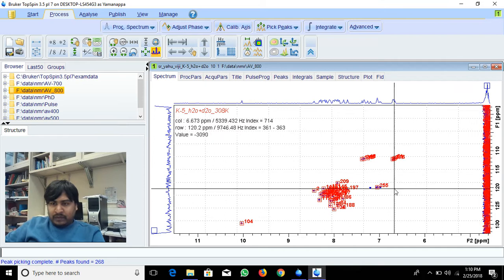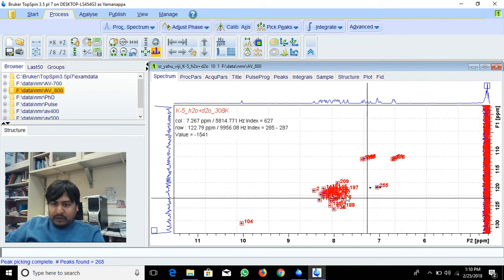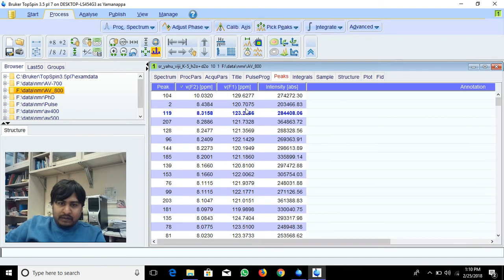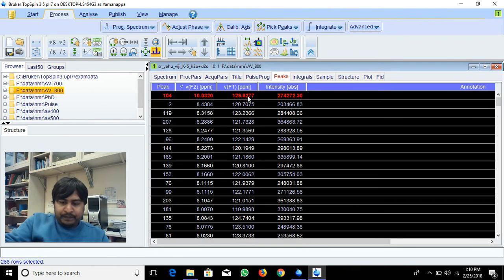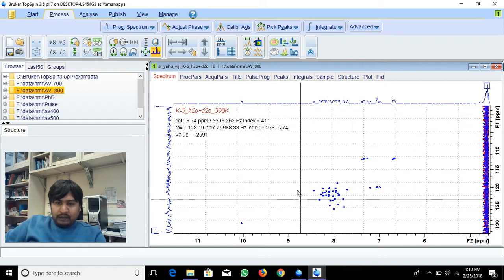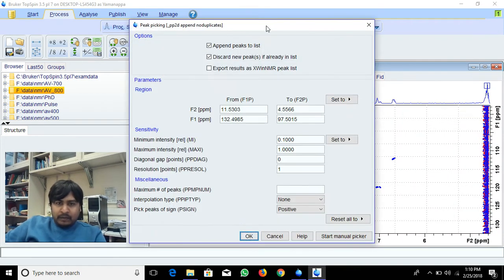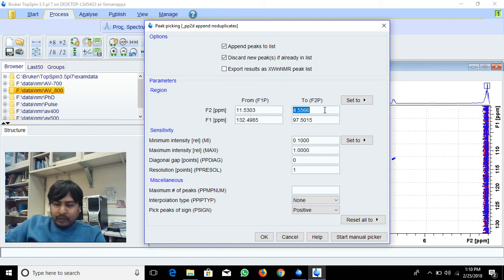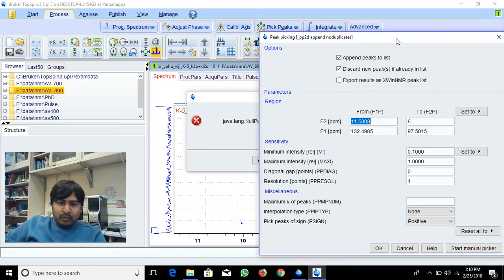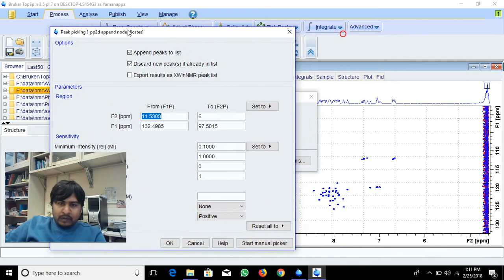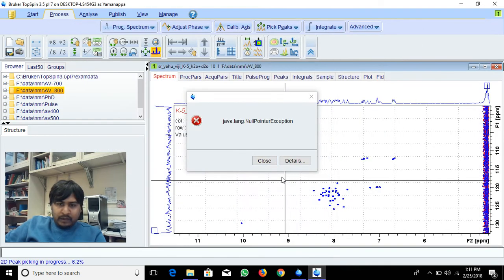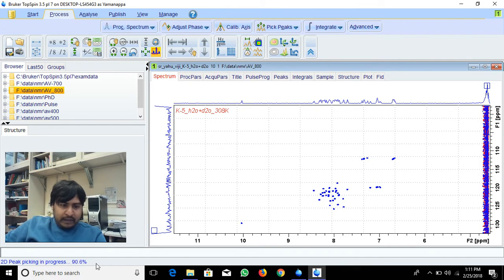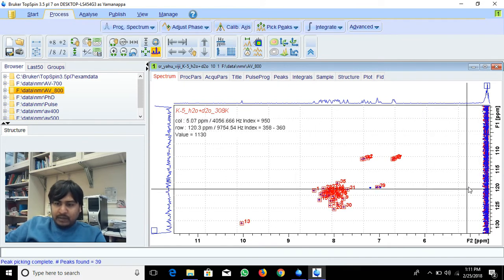Again I will give a PP command. I will give a range from 6 PPM to 11 PPM. Okay. Now see, it's running again. It selected only this peak, it didn't pick this noise.